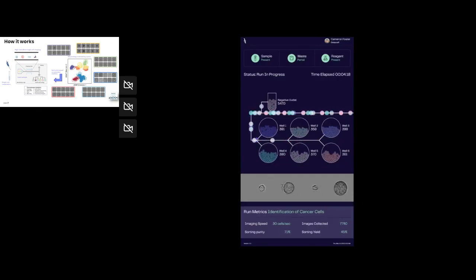So again, you see here the very fascinating queue where you separate the cells. You see the cells coming along from the camera. They get recognized, and the AI immediately is sorting them, and basically you can capture the fractions for follow-up research.